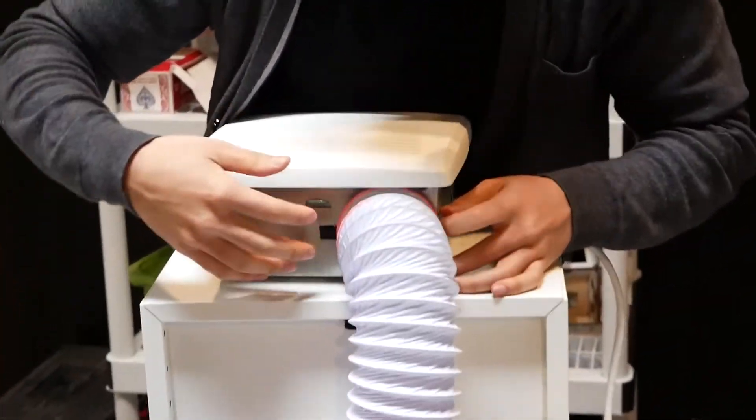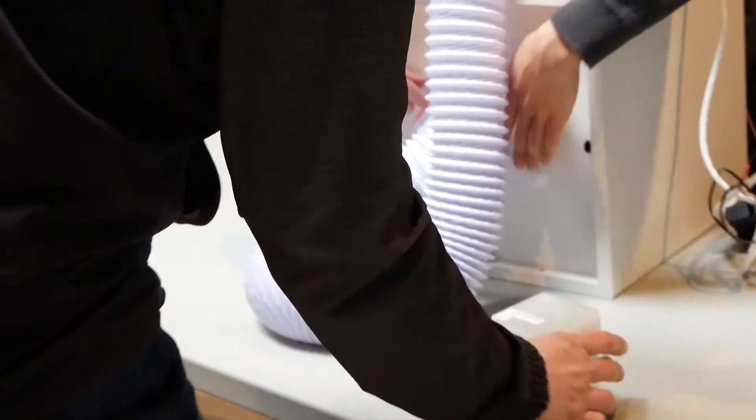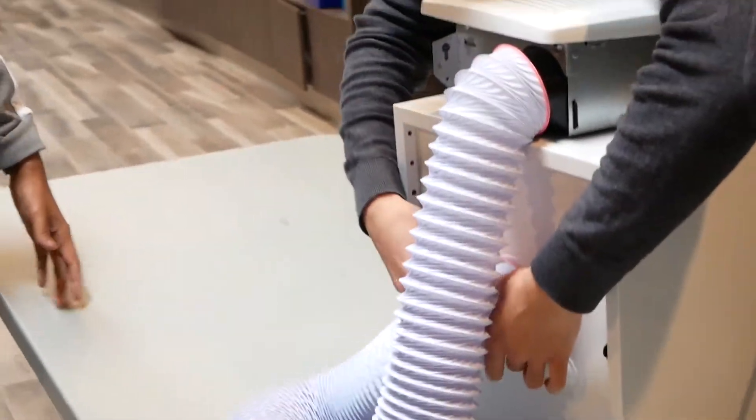If any contamination gets into this enclosed environment that you create, it will essentially kill the plant from the inside because nothing gets in and nothing gets out of the vessel.